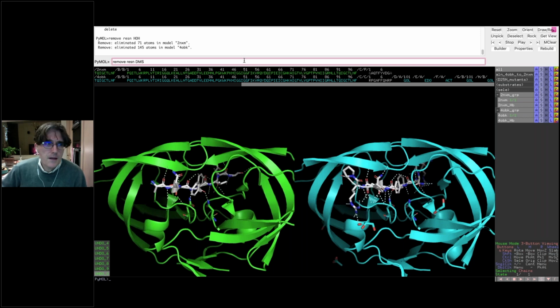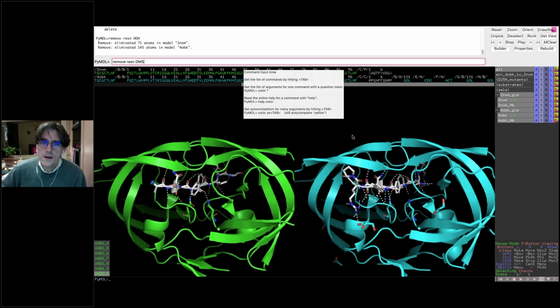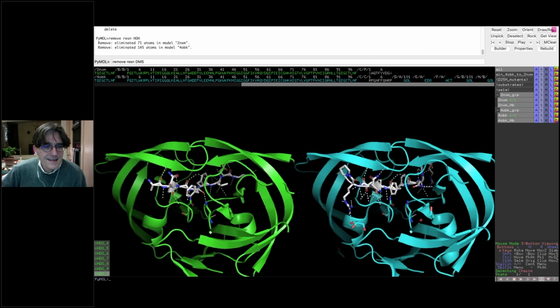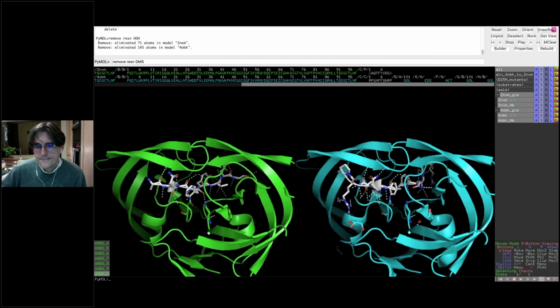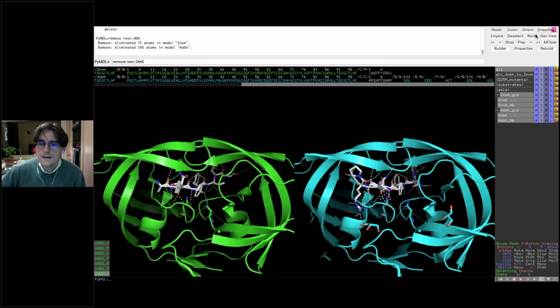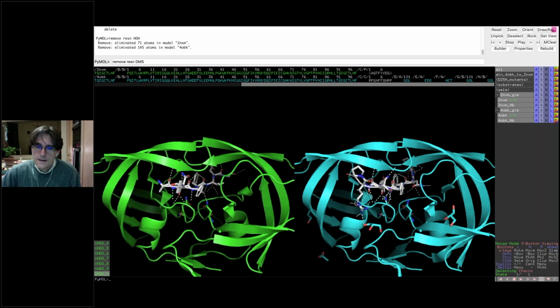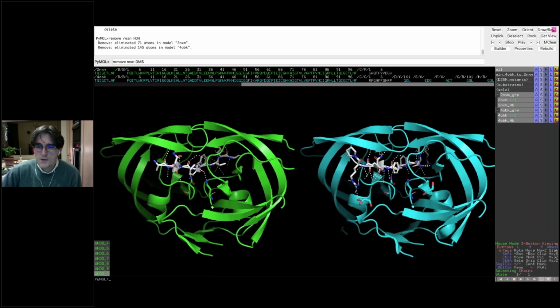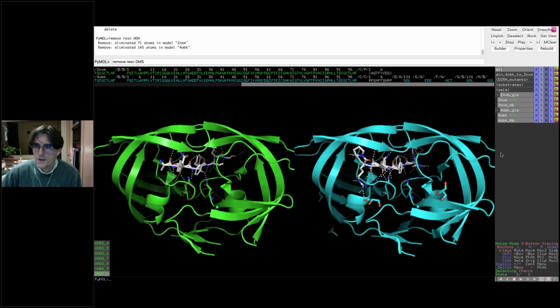Maybe I could show a little bit of sculpting. Well, the other thing that I know people have always asked me about, and it's probably worth showing, is when you're trying to do something for a potential docking study and you have a protein structure, how do you get rid of the ligand that's already there? Okay. Imagine we wanted to dock to one of these HIV protease systems.